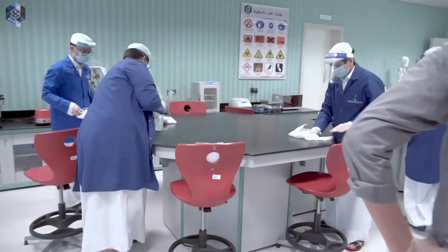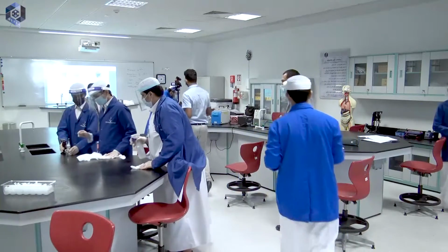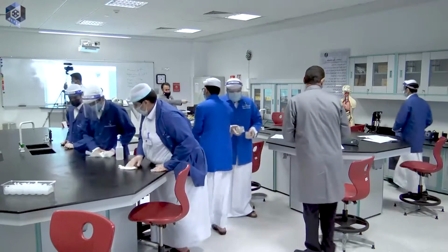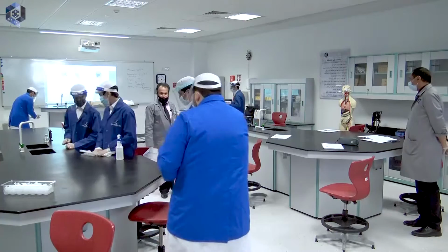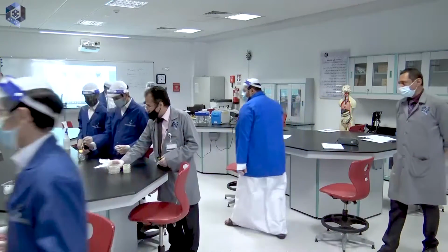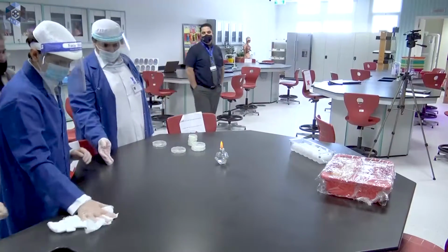Shahwani, can you please bring the source plates, the bacterial source plates and the Kanamycin plates to this bench? Take them twice. Imadi, now the other Kanamycin plates, please bring them there closer. Place them on the bench. Put them there aside. Now, let's examine these plates. Mr. Basem, can you please turn on the visualizer there?